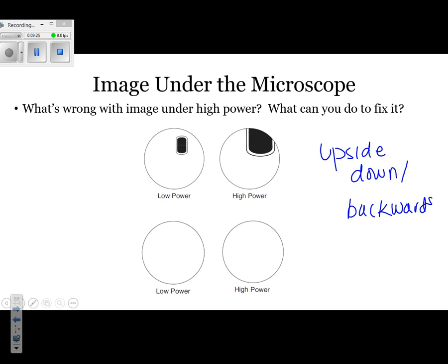When you're looking at the image, ask yourself: why is the one under high power not ideal, and what can we do to fix it? If you look at the one under low power, you can see the entire specimen, but when you look under high power, some of it gets cut off. The fix is simple — move the specimen to the middle. Once you move it to the middle, that'll ensure it stays in the field of view when you switch to high power.